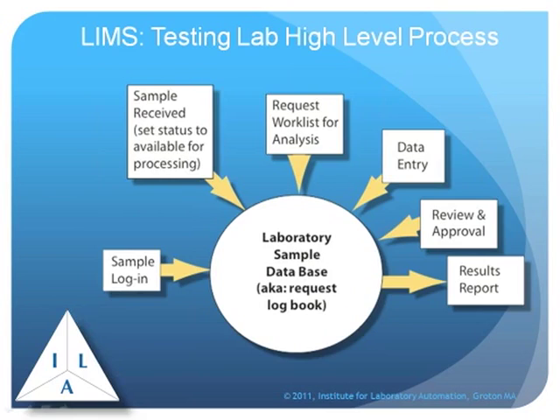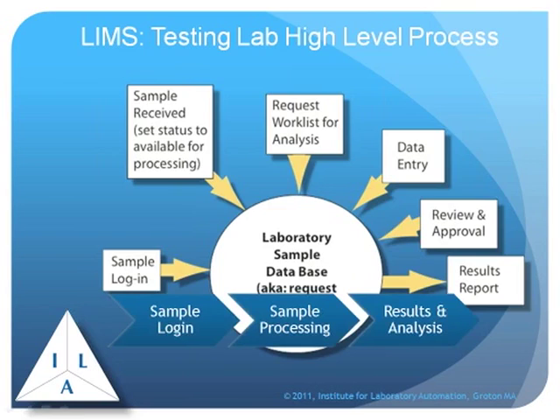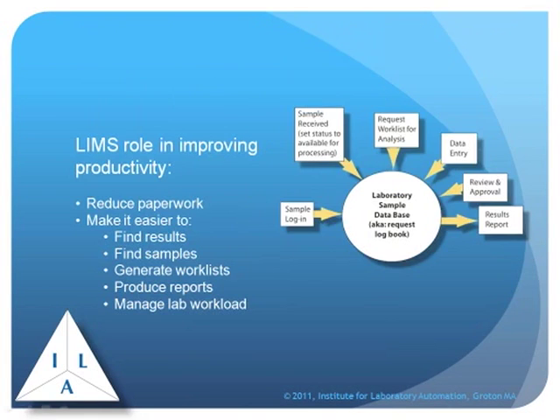Listing should also include where they are and what the priorities are. You also need the ability to enter data and do reviews and approval and finally get the results out. So for any type of testing laboratory in almost any industry, the process is the same. Samples come in, samples are processed, results go out. That's the basis that LIMS systems use for their development.